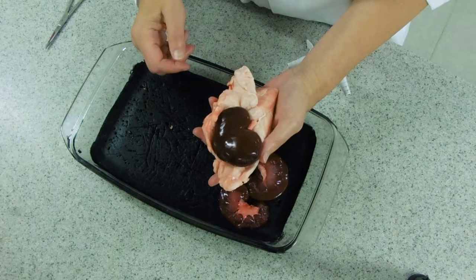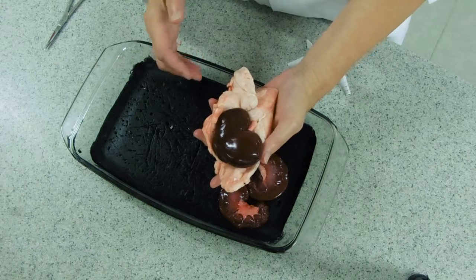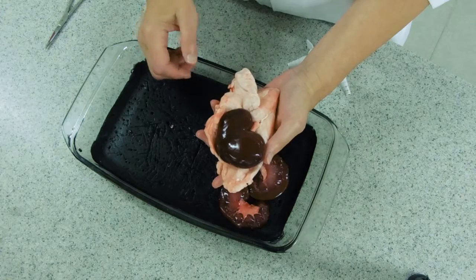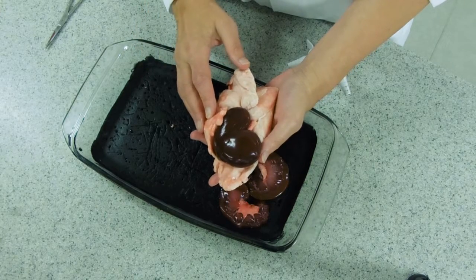This is a little video to show you the dissection of the kidney. When you pick up your kidney it will be covered with a layer of fat which is used to protect the kidney from mechanical shock.